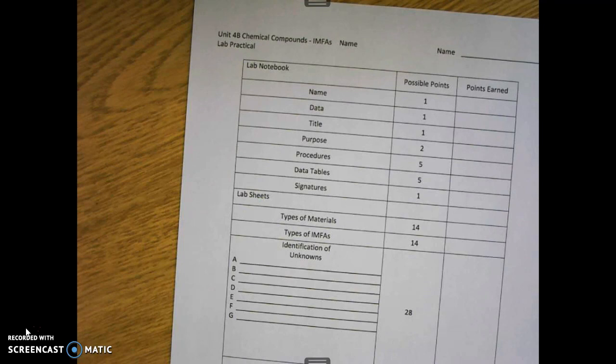All right, so hopefully this gives you a little bit of an idea about the lab practical. Just remember, you only need 2 pieces of data, and just because you can do a test doesn't mean you need to. If you use something as simple as it's a liquid at room temperature, that's a piece of evidence, that's a piece of data.